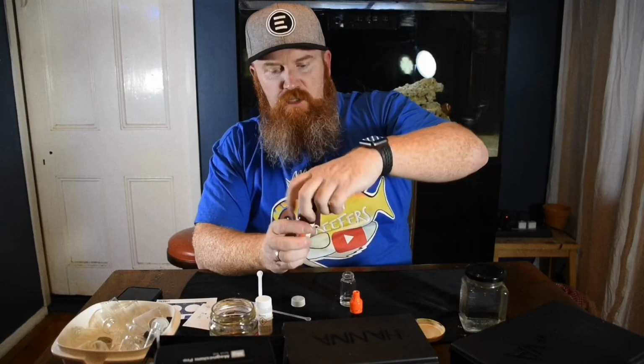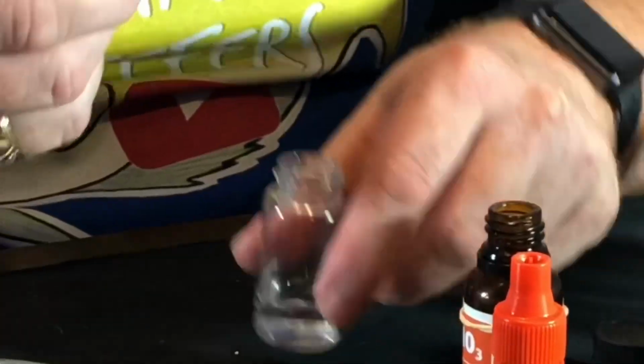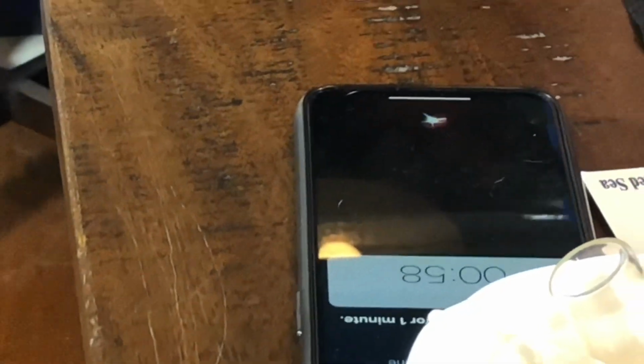Alrighty. Next one is your reagent B. This one you need to get a level scoop and put it in. Hey Siri, set a timer for 1 minute. Okay, your timer is set for 1 minute. This one requires you to mix it for 60 seconds or 1 minute. So I always use my timer on my phone to do that.